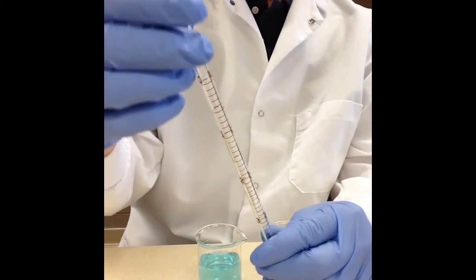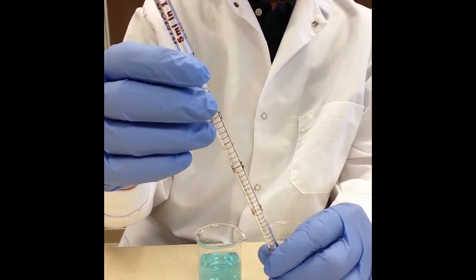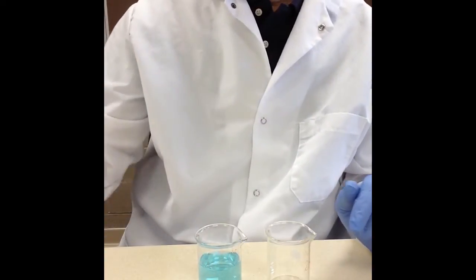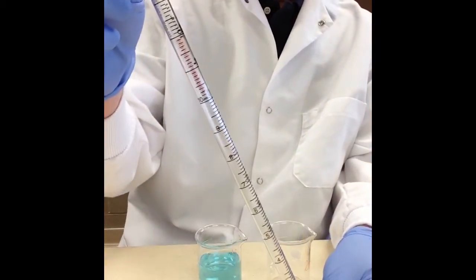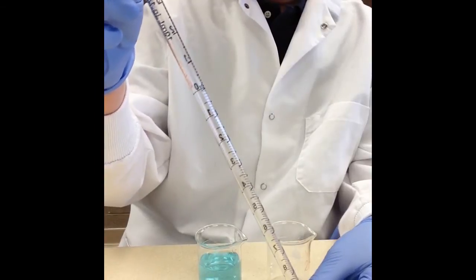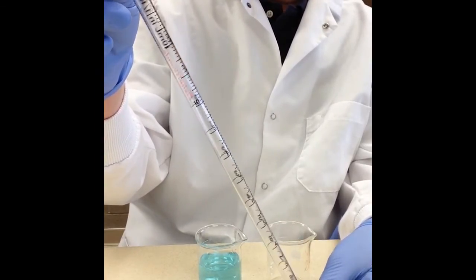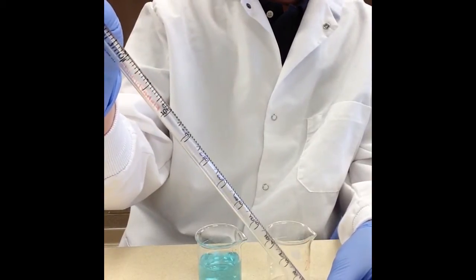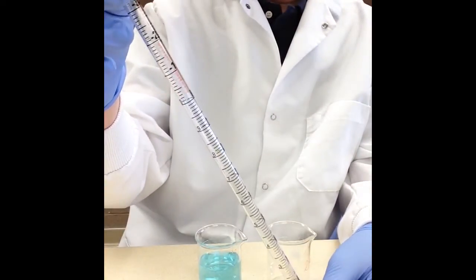Now that's a little bit strange that if you want 5 you go to 0 and I'll show you another type of pipette here. This is a plastic disposable pipette. I kind of hate the idea of disposable that you would throw every time you use one of these things that you would throw it away because the glass ones we can wash and use over and over again.